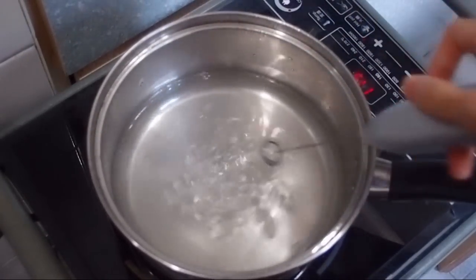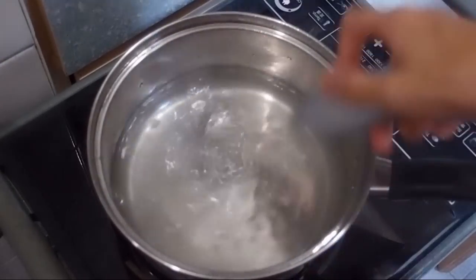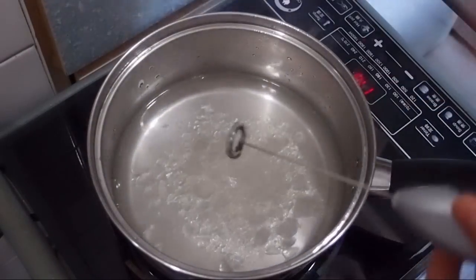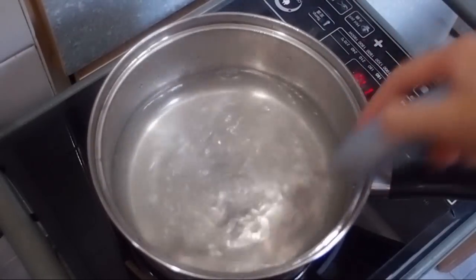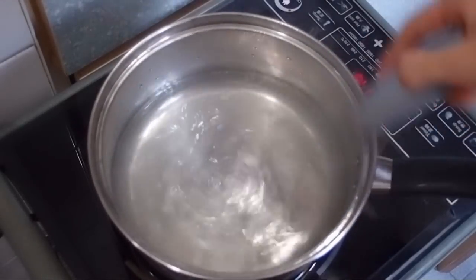Use a stirrer to dissolve the alum crystals in order to speed up the process. Just add more alum powder or crystals when they are completely dissolved. We are going to make a saturated solution. If alum crystals no longer dissolve, that means you have made a saturated solution.